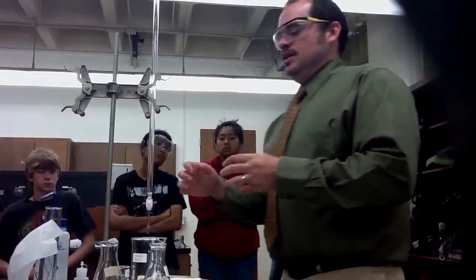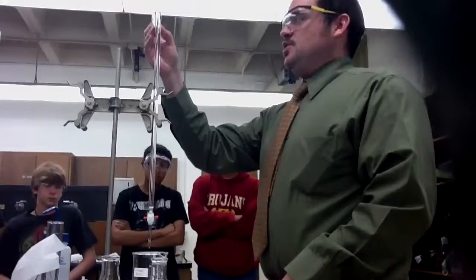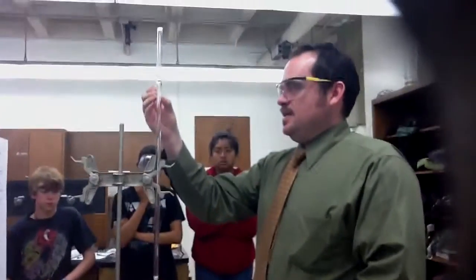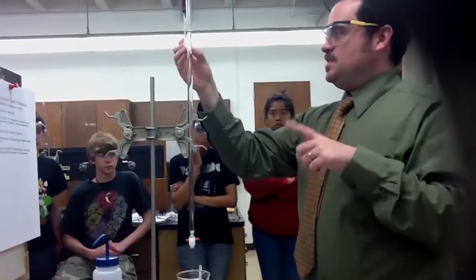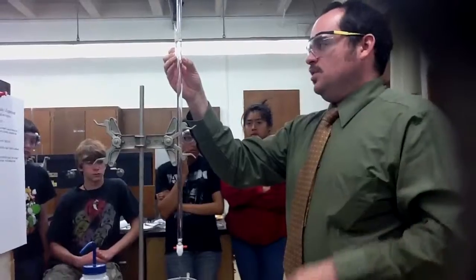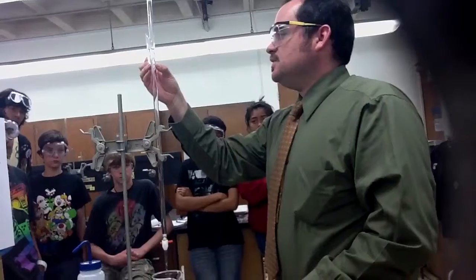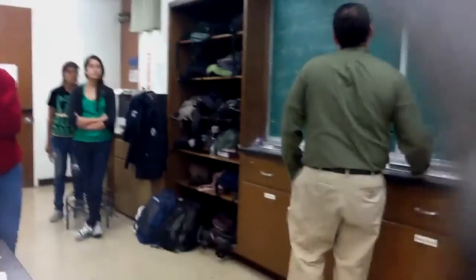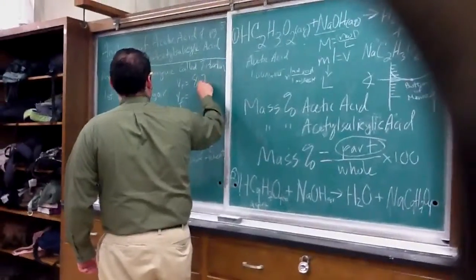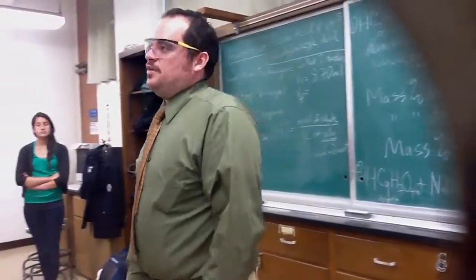Okay, so now the first thing is this. I'm ready to do this now, so I'm going to go ahead and take my initial volume measurement. As Dave mentioned, and I have a picture over here, it's going to read the bottom of the meniscus, which looks like a concave, a U below. Let me make sure it's eye level. This is reading 8.7, so 8.70 milliliters right now. That's your volume.